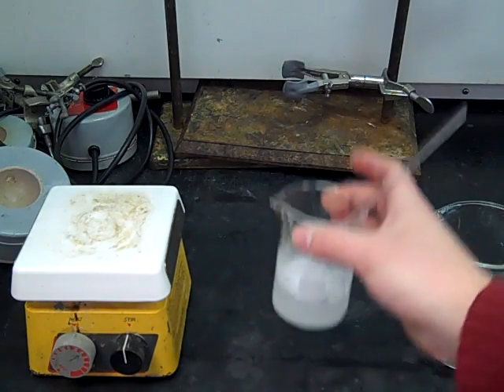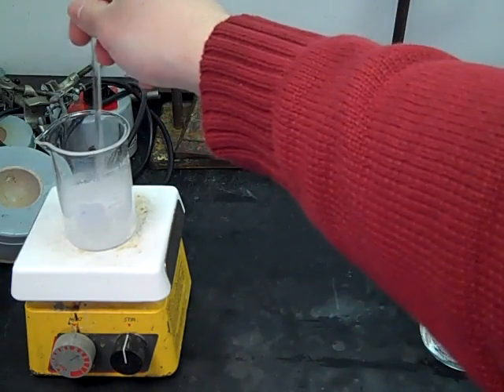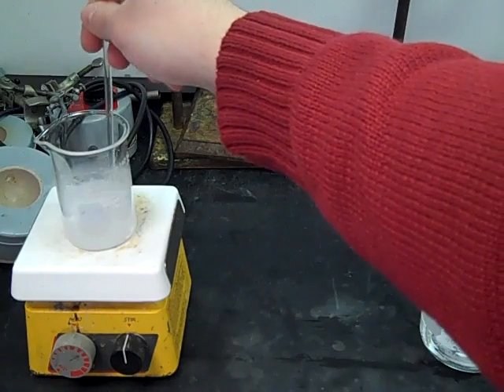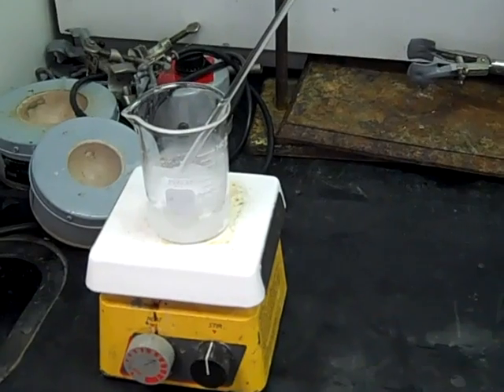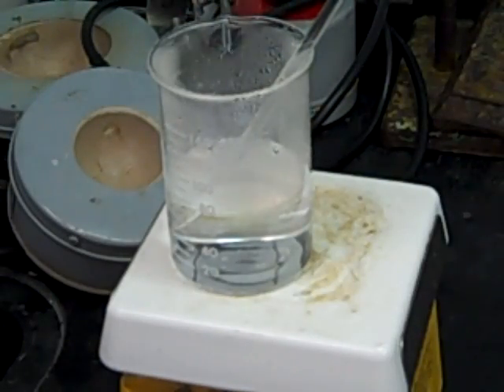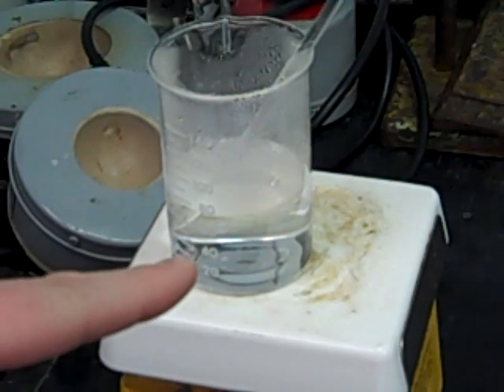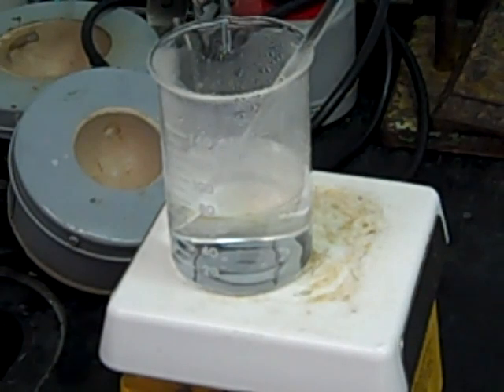Since the water I put in was only about 50 degrees Celsius, I'm going to put it back on the hot plate and eventually we want all of that solid to dissolve. Now you can see after heating this for a while, all the solid has dissolved. The solution is now near boiling, so hopefully all of our material is dissolved in there. Once this all dissolves and boils for a second, we'll be ready to start the recrystallization process.